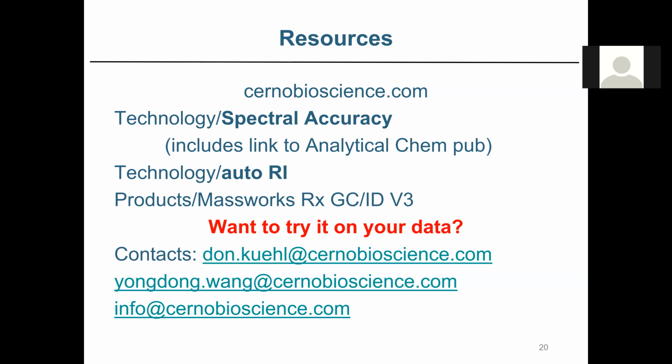Thank you, Don. Another question: is it possible to provide a real data file for a more customized demo, and is there any difference working with data files from different vendors, such as the Shimadzu system? Absolutely, you can do that. In fact, if you look at the red type there on the slide, it says, "Want to try it on your data?" We do this routinely. You're welcome to submit your data, and we'll process it for you.